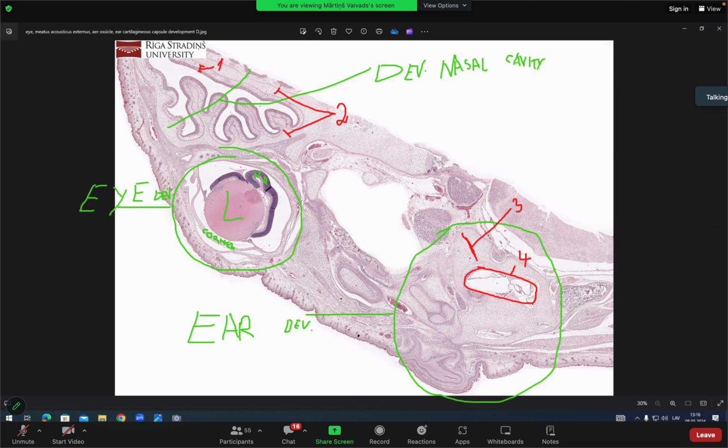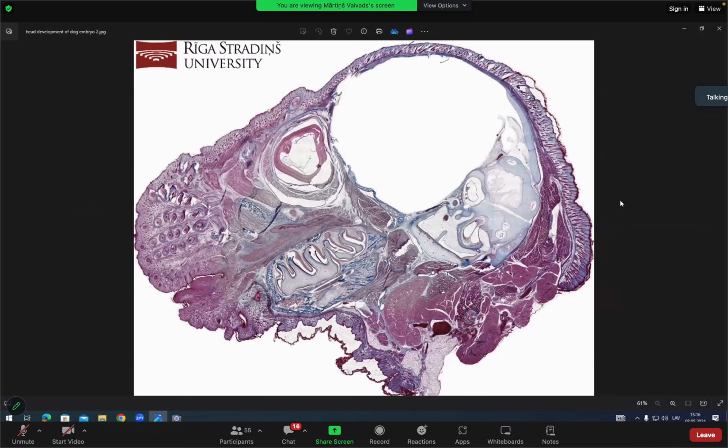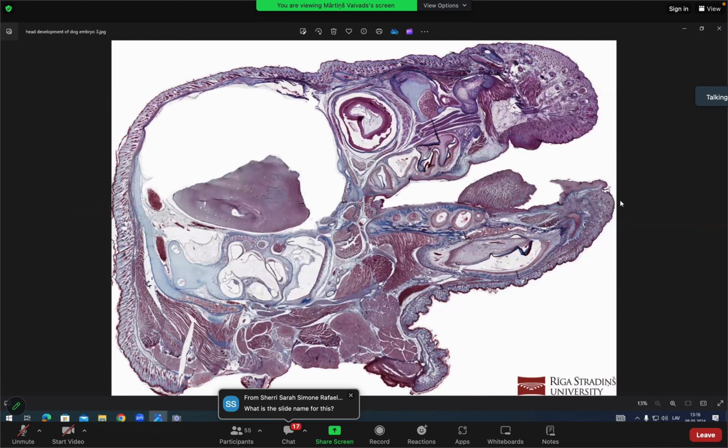And next, we can move on to the dog's head slide. So dog embryo's head sagittal section. That will be the next one. I will check what is in the slide plates because there's some limitations. Most likely I have rat's head here, but rat's head slides are quite limiting. Here we got lucky. We have a dog's head. Good.